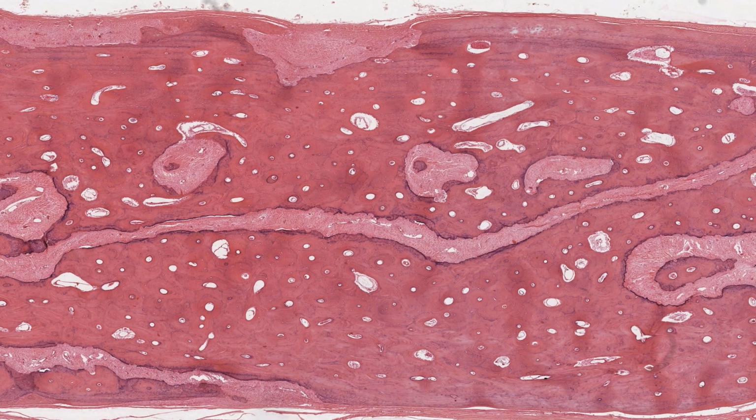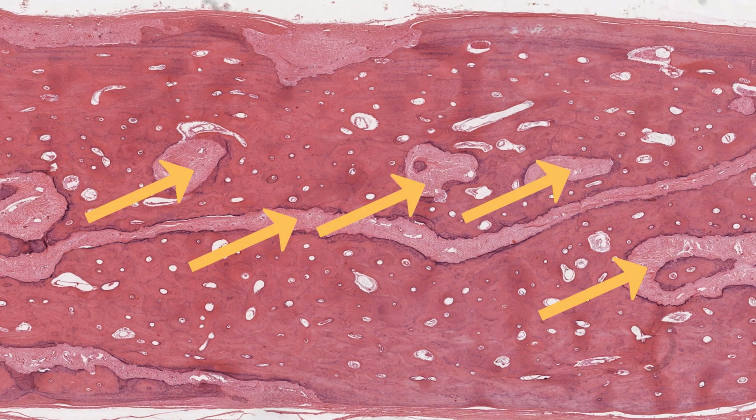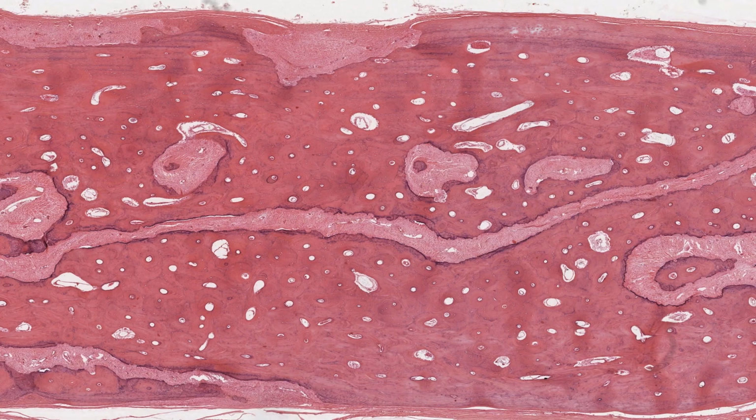In places, the section cuts into the ligament of the suture between the two bones. This gives these rounded islands or long profiles of dense connective tissue. In a few places, the section has dipped all the way through the ligament to graze the tip of protrusions of the other bone, here, here, and here. These bits of other bone show up as a small blob in the middle of islands of ligament.